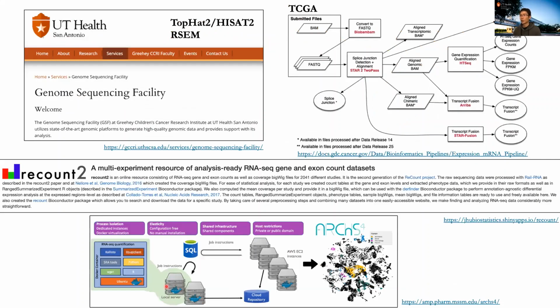Okay, so there are many alignment tools out there, and you probably want to ask which one is the best one. Okay, so I'll conclude. I tried to Google some of the large projects, like what alignment tools they use, and also our course.